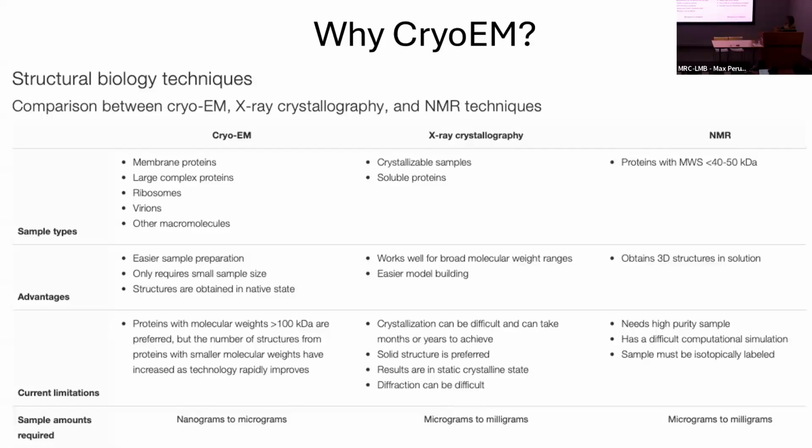Cryo-EM really started from the ribosome, single particle. For 2D crystals, like bacteriorhodopsin, because they are naturally crystalline, of course you can use electron diffraction. But electron diffraction with the electron microscope is, in fact, a type of crystallography, so we cannot really count it. We say we can look at the sample in this range without needing a crystal to start with. Also, because you have the water around it frozen, it is in a more physiological condition, with no shrinkage or chemical fixation damage.